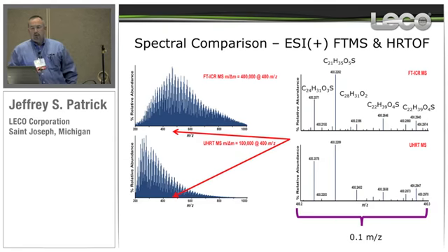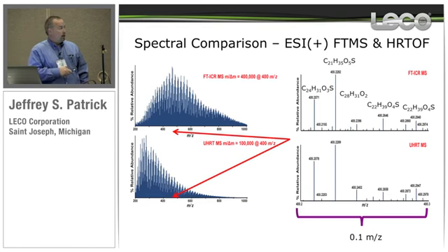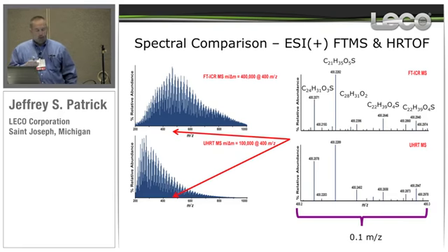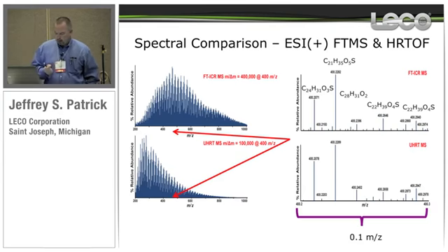There are differences in the distribution, but remember, there are very significant differences in the ion optics between these, and we have other data not included here that we can certainly share or discuss, where we can change this profile, or they can change theirs, by changing ion optical parameters that cause biases in where the distribution of M/Zs are. So I'd ask you to not focus too much on this, but focus on the meat, which is the M/Zs, the measurement, the information content.